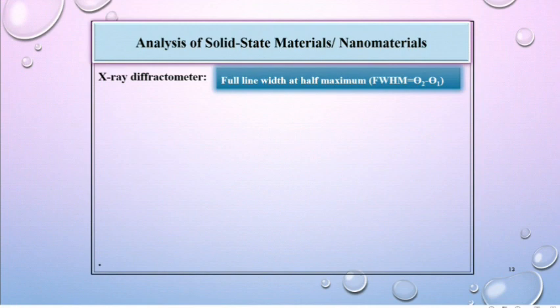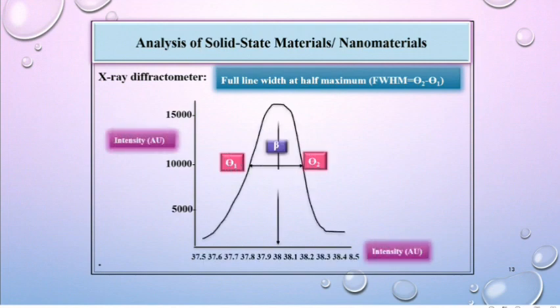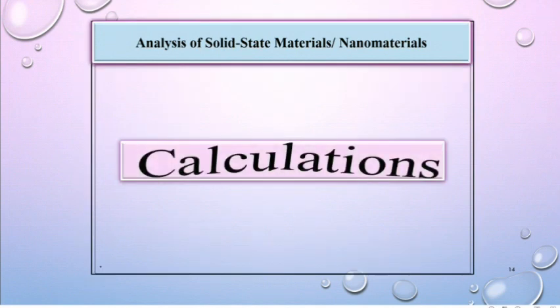Calculation of FWHM from the expanded view of the most intense peak is as such. Next part is the calculation.